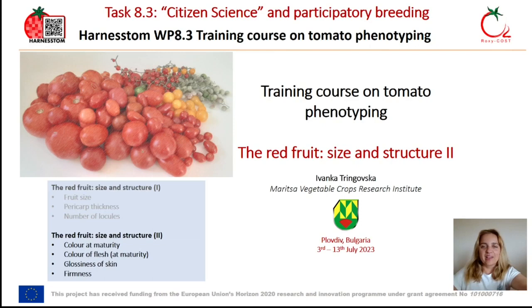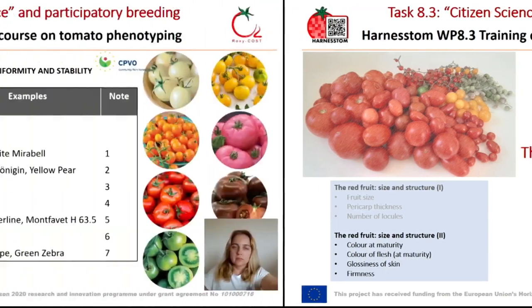Hey, welcome back. This is the second video about phenotyping of traits related to mature fruit of tomato, which concern its size and structure. I will share with you some tips on evaluation of fruit external color, color of the flesh, glossiness of skin, and fruit firmness. Let's begin with the next trait, which is color at maturity.